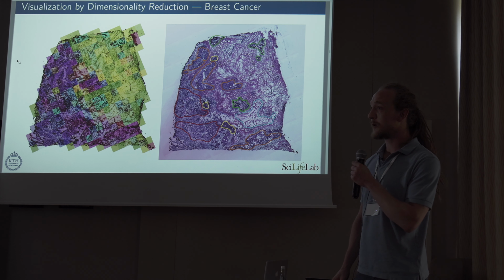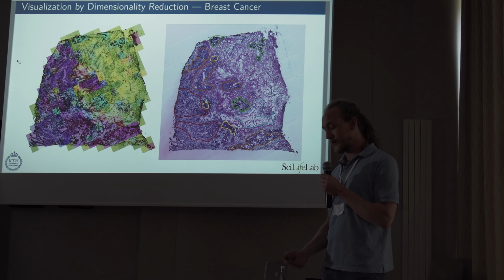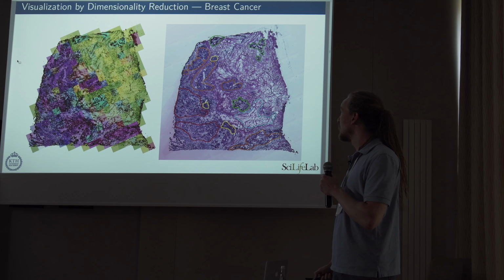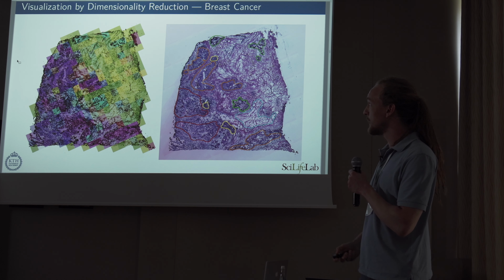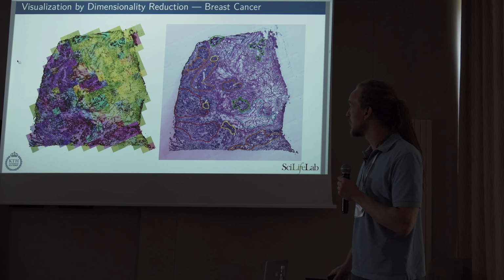You will observe that if you do this dimensionality reduction-based visualization of the information that we get from the transcriptome, we get a rather neat mapping between that. For example, what's green here is also in this mint shade of green here, and the fatty tissue is mostly in this yellowish green. That's fairly concordant. You will also note that between the invasive tumor and the solid tumor, we have purple versus pink.